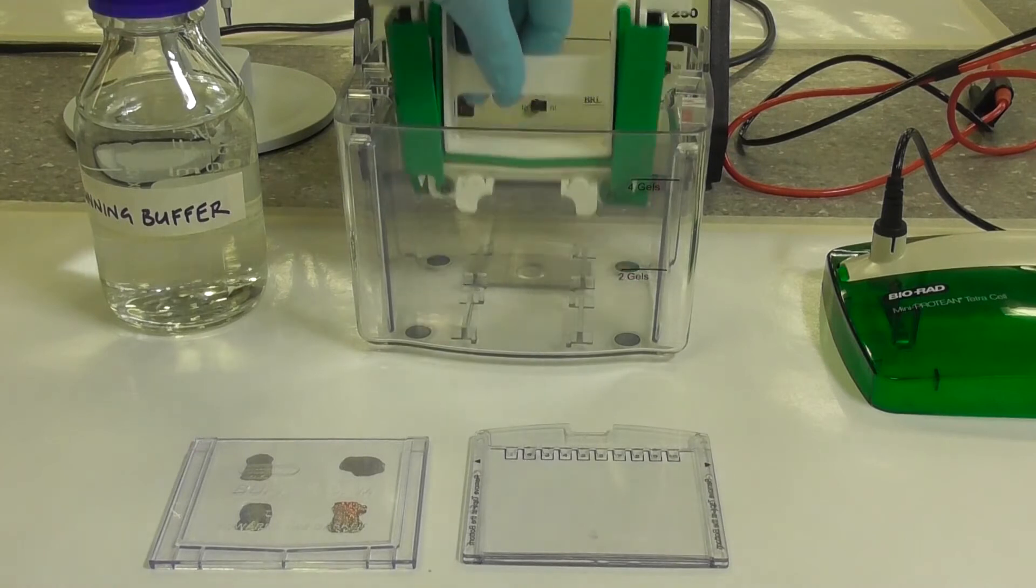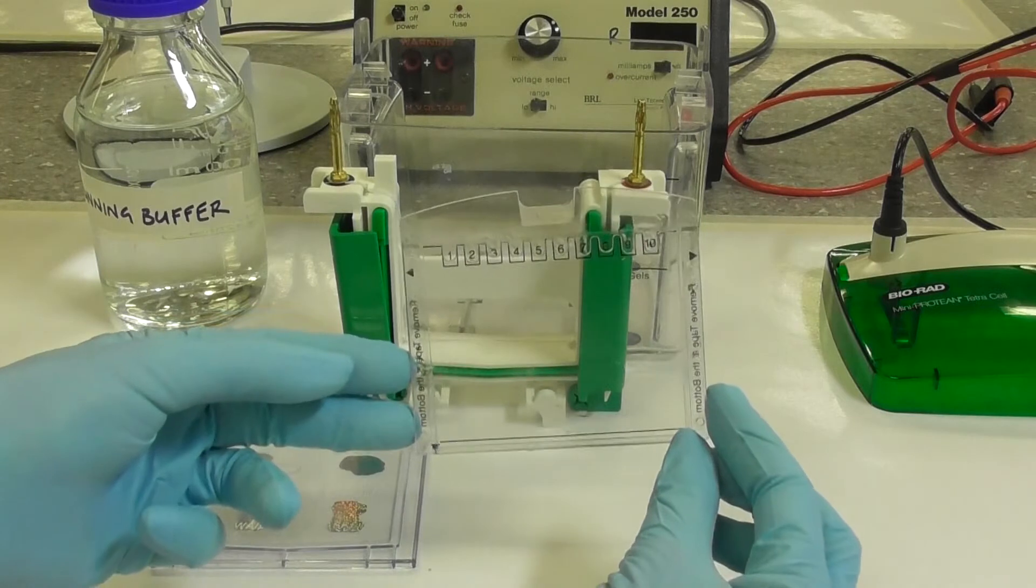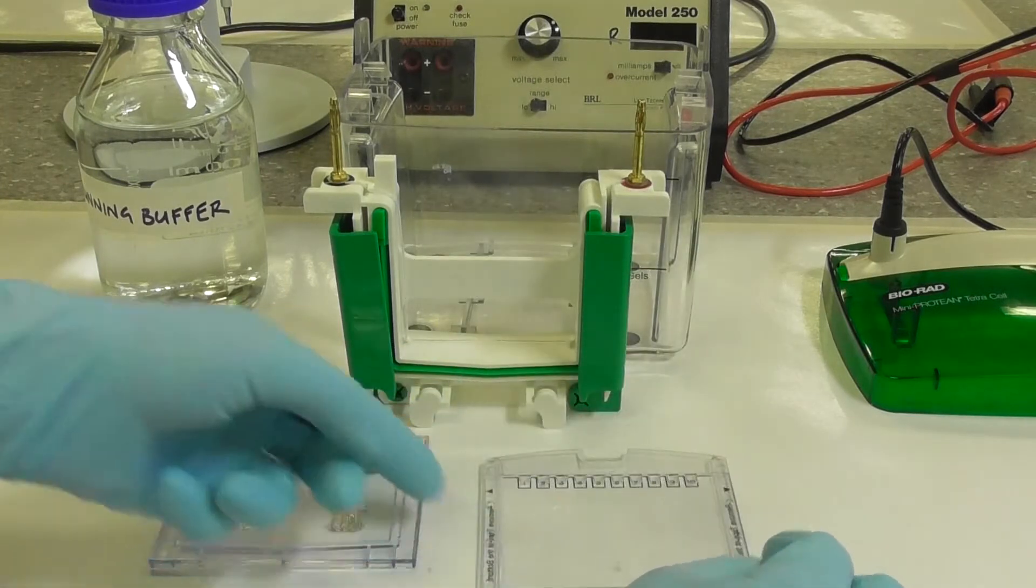Remove the inner electrode assembly unit. You will use your precast gel along with a buffer dam plate to complete the assembly of the electrode unit.